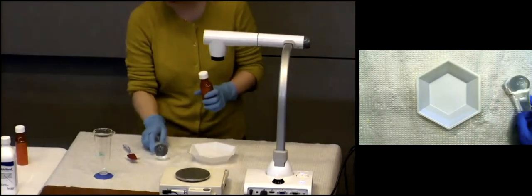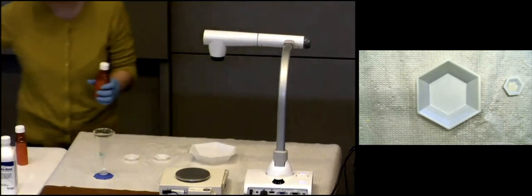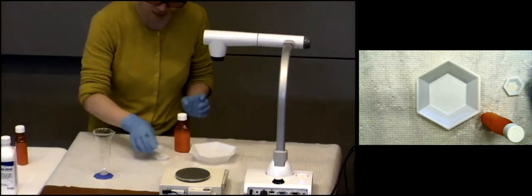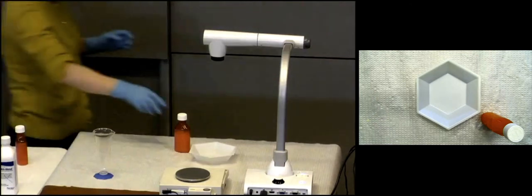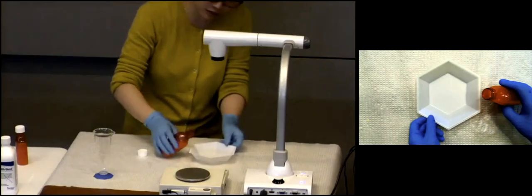So turn to your QA section. You're going to fill out the QA section. So what does the first part of the QA say? The product weight or volume. So we're going to do volume. So Judy, before you pour anything out, do a double check here and tell us exactly what the volume is. It's 80 mL. We did verify that it's 80 mL, so document 80 mL. Right. And I just shook it, and let's pour some out.